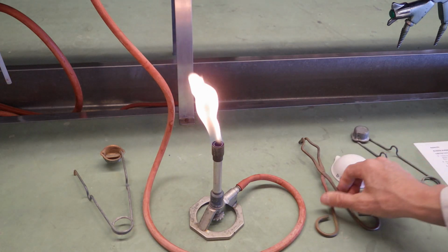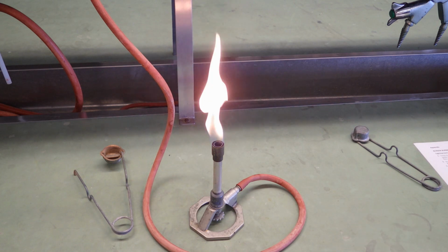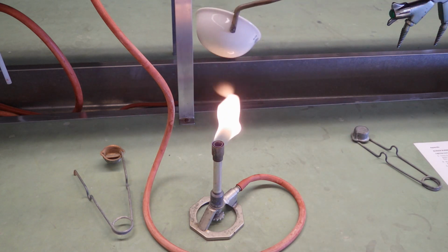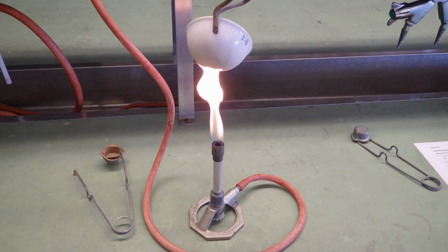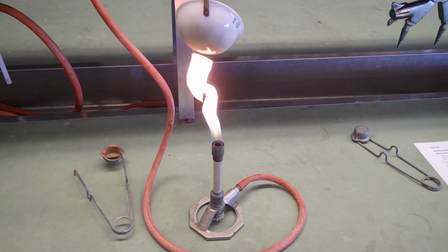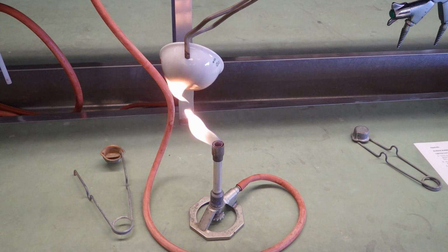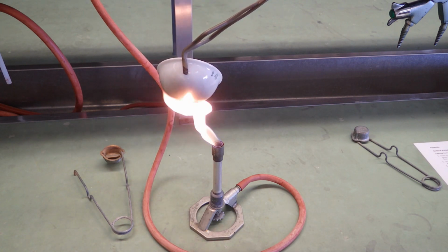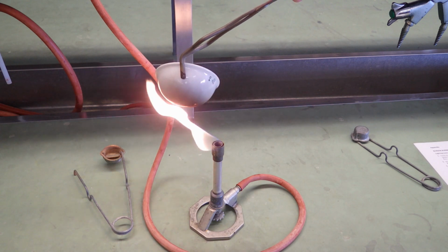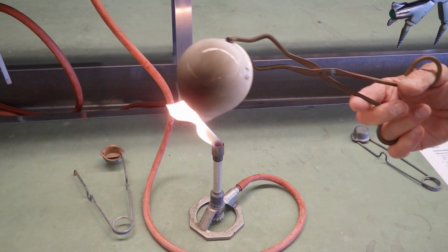Good. Now, with the barrel closed and no air, it lights easily, but you don't want to run your burner like this. The luminous flame means there's unburned carbon particles, basically soot, that will deposit on your work. So you don't want to run it like this. I'm just holding the crucible here to show you the amount of carbon that will build up. This needs more air. Right, look at all that carbon.